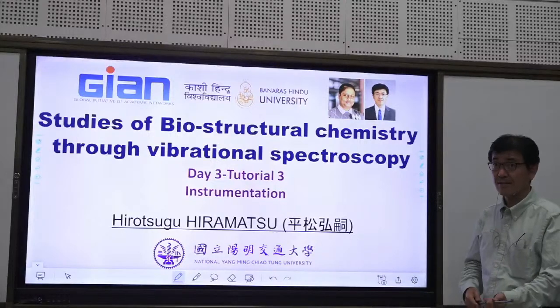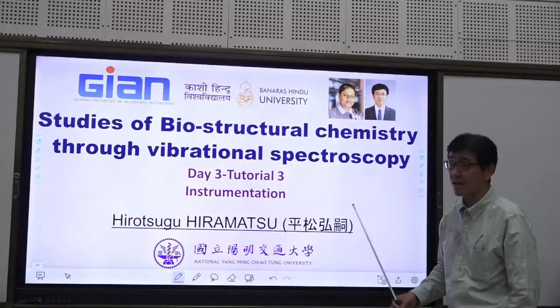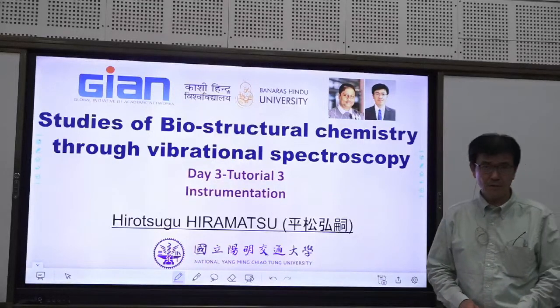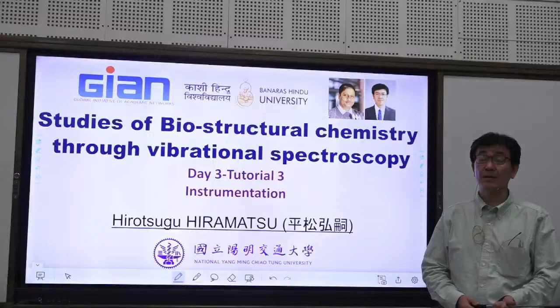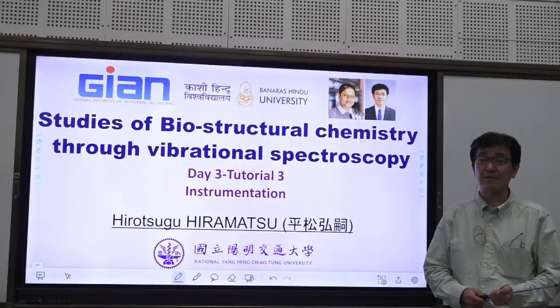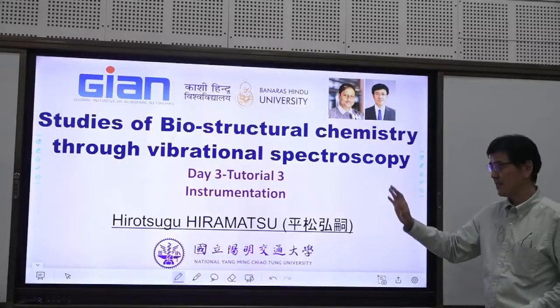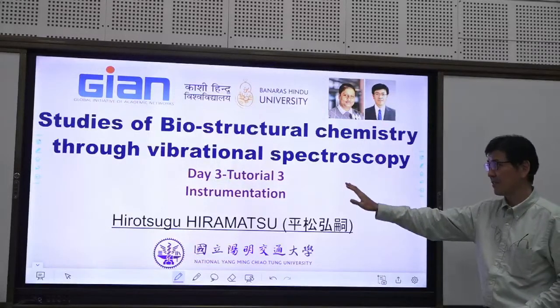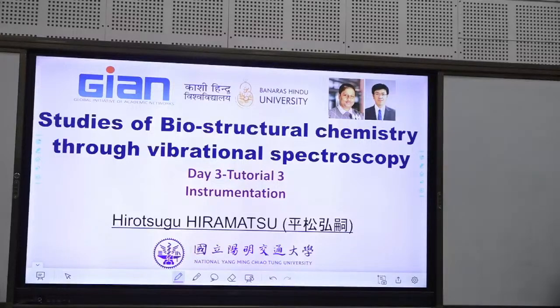Today, in this period, I talk about the instrumentation. So already you use the Raman microscope and ATR FTIR, and you have some experience about vibration spectroscopy. This talk is about some description about each component in the Raman spectrometer.